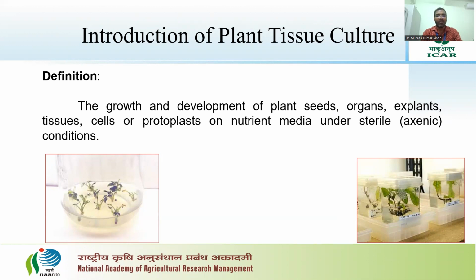Now, introduction of plant tissue culture. First of all, I want to define plant tissue culture. Plant tissue culture is the growth and development of plant seeds, organs, and explants on nutrient media under aseptic conditions.